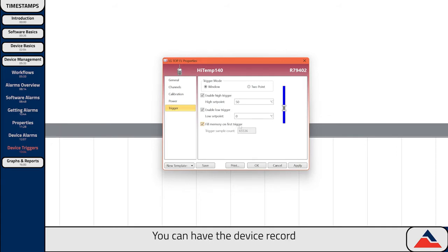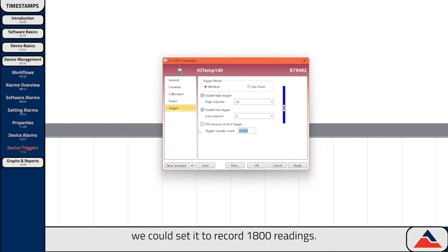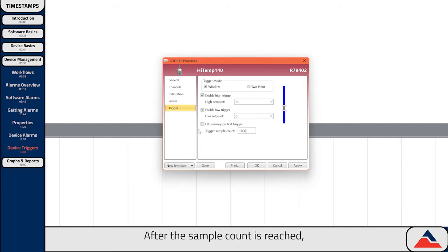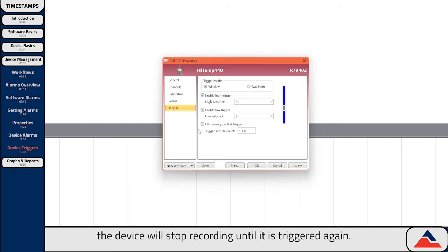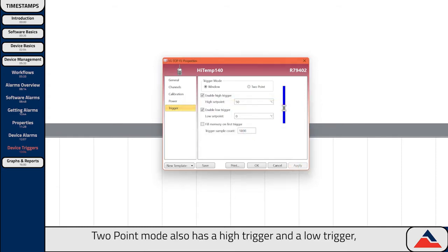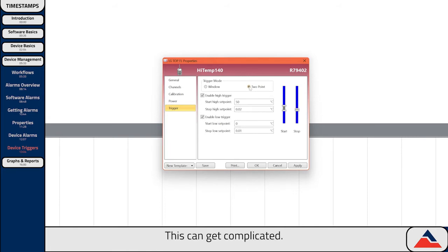You can have the device record until it fills its internal memory by checking this box, or if you wanted to have it record for say half an hour, we could set it to record 1800 readings. At one reading per second sample rate, that comes out to 30 minutes of recording. After the sample count is reached, the device will stop recording until it is triggered again. When you're happy with your settings, hit Apply. Two-point mode also has a high trigger and a low trigger, but each of these features both a start and a stop threshold.